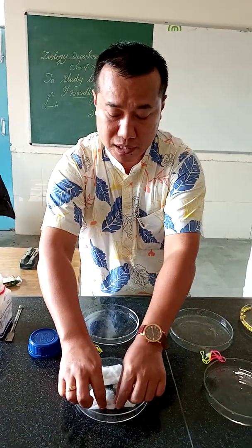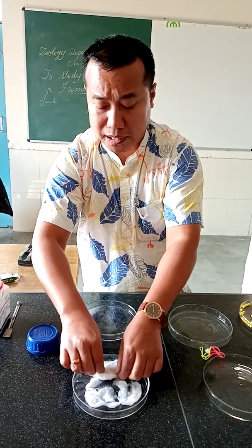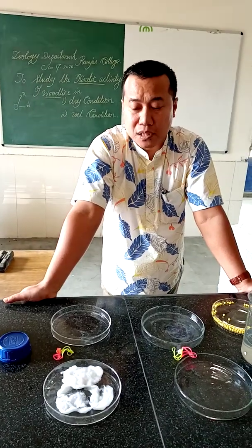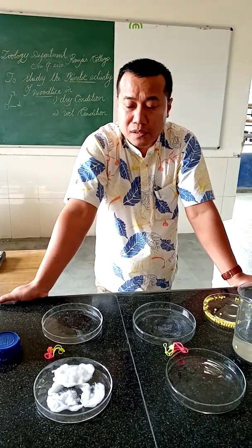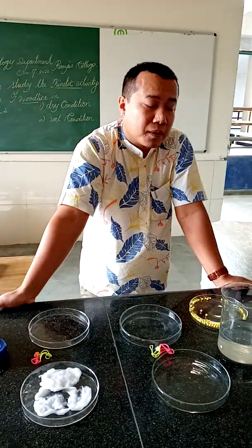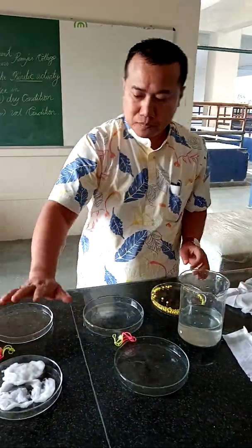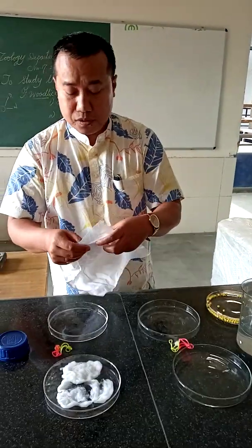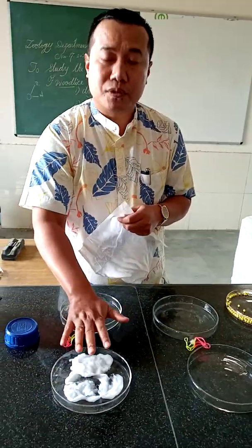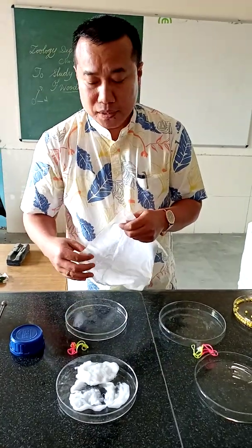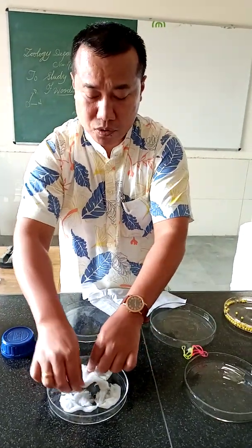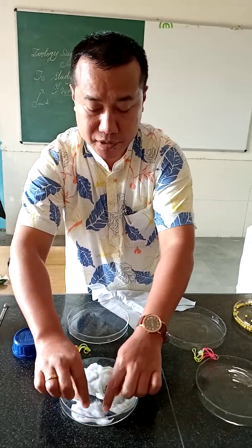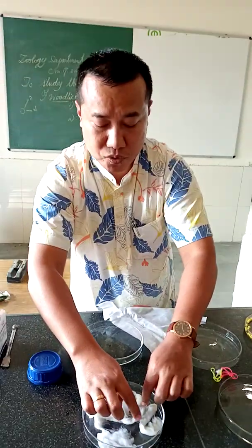This particular animal is terrestrial in nature, no doubt, but due to evolutionary pressure and its phylogenetic history, it still has many characters similar to crustaceans which live in water. So I make this particular container's environmental conditions as wet as possible. When we spray the cotton swab, it should be sprayed uniformly so that every corner of this chamber is exposed to wet conditions.